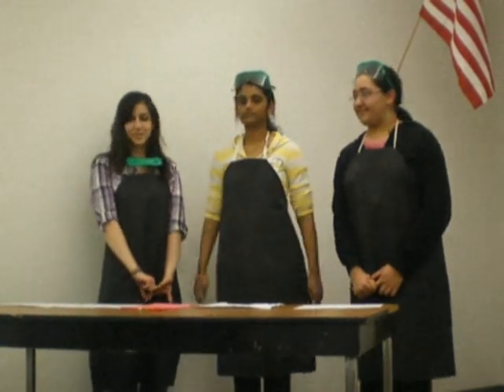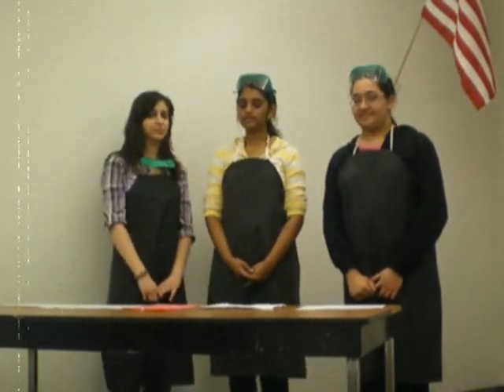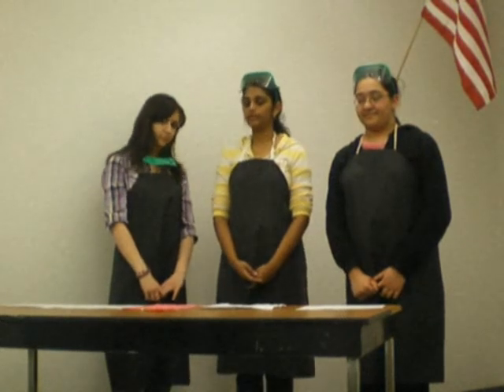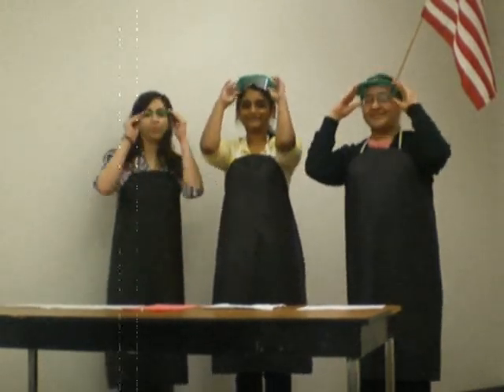The lab we will be conducting today is called the Precipitate lab. This lab will introduce us to the concept of driving forces, which is the main reason why reactions occur. The lab will allow us to practice recognizing precipitate reactions, and we'll be given 10 pipettes with 10 different solutions, each with a molarity of 0.2. We'll also be testing solutions in pairs, looking for reactions in the forms of color change or formation of precipitate. Some will react and many will not, but always make sure you wear your goggles and your apron.